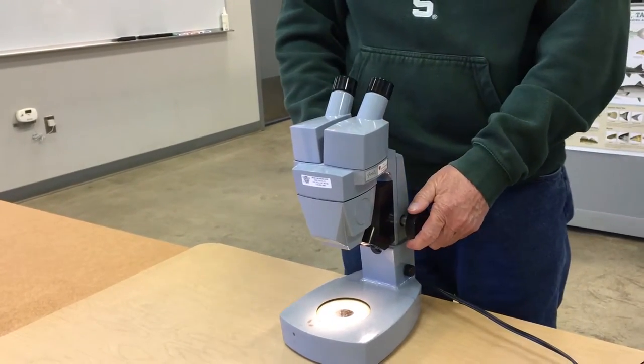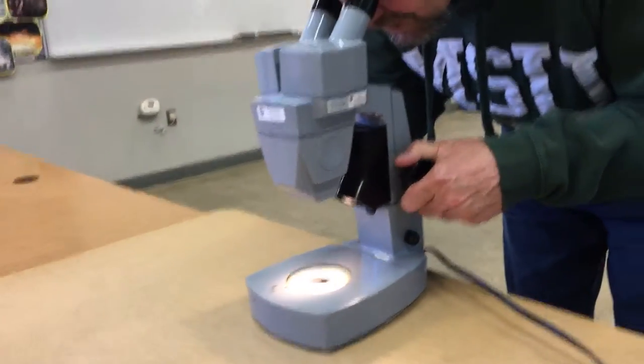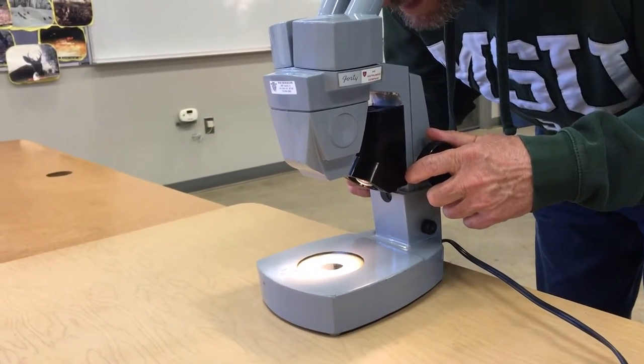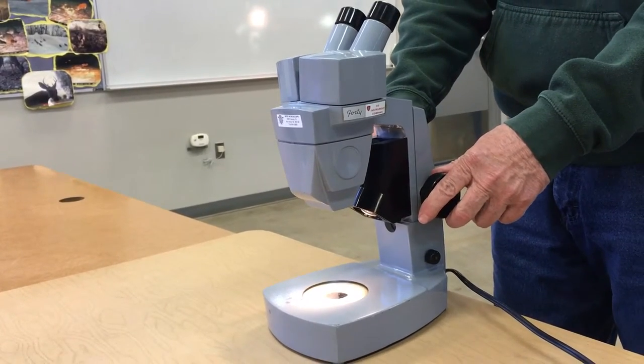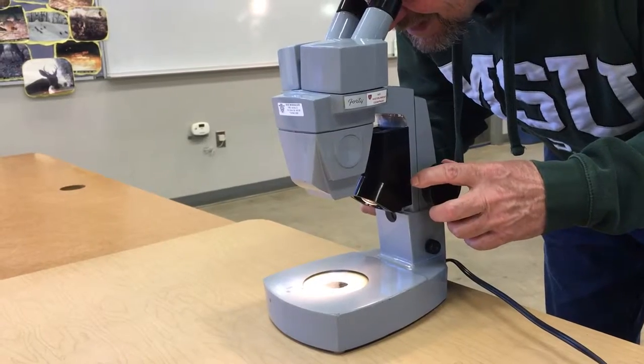On the side here you have your focus. What you want to do is focus down on the specimens that you're looking at, and if you have a fair amount of water in your container you'll have to go up and down, because it basically is taking a slice or a layer.